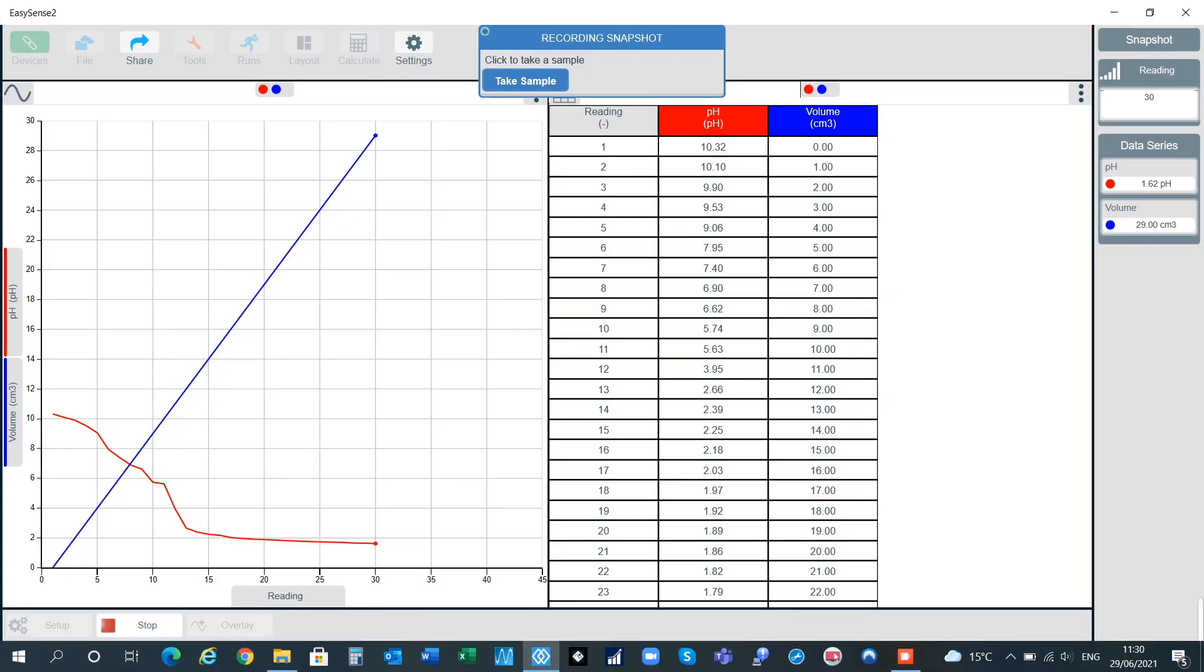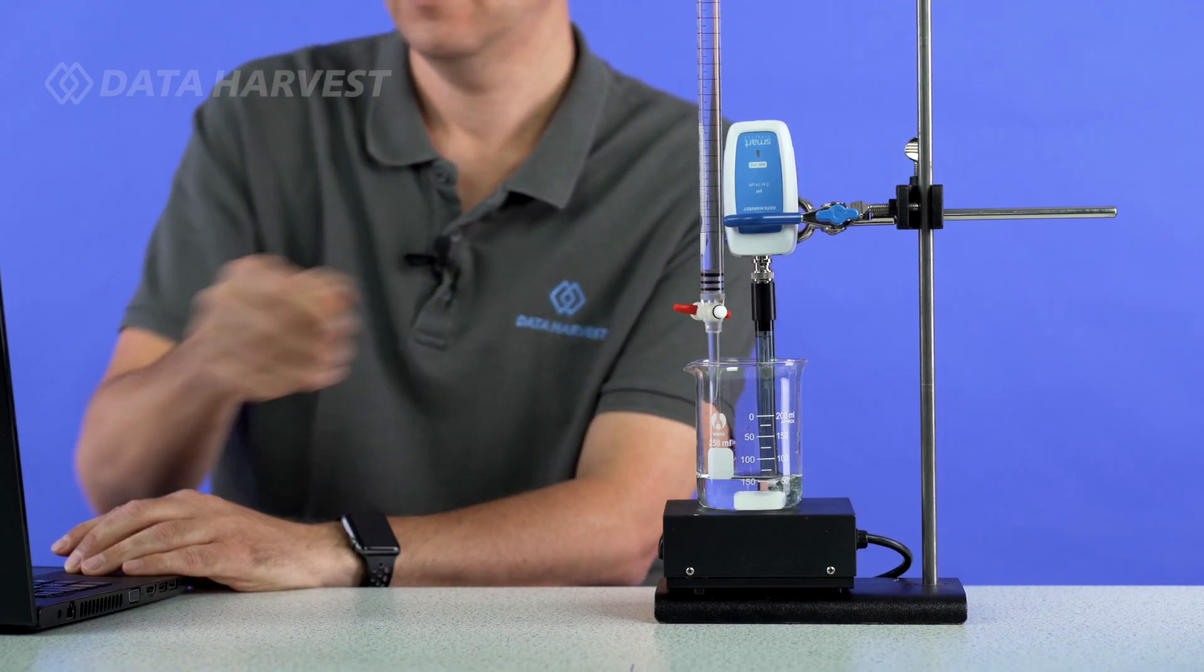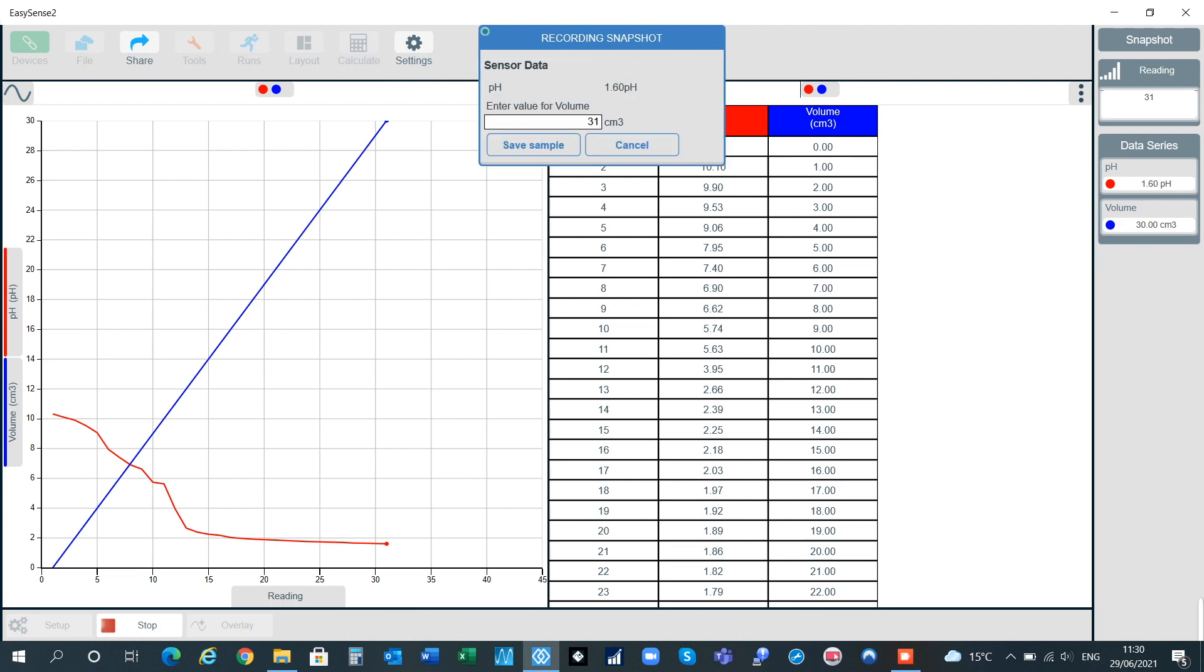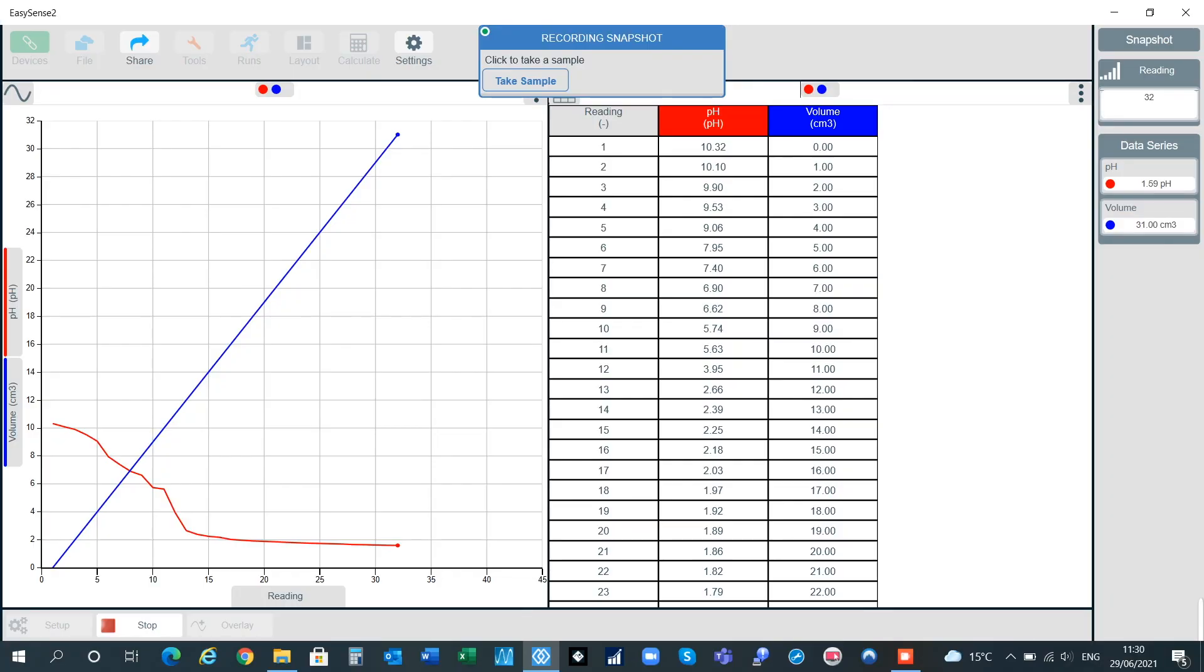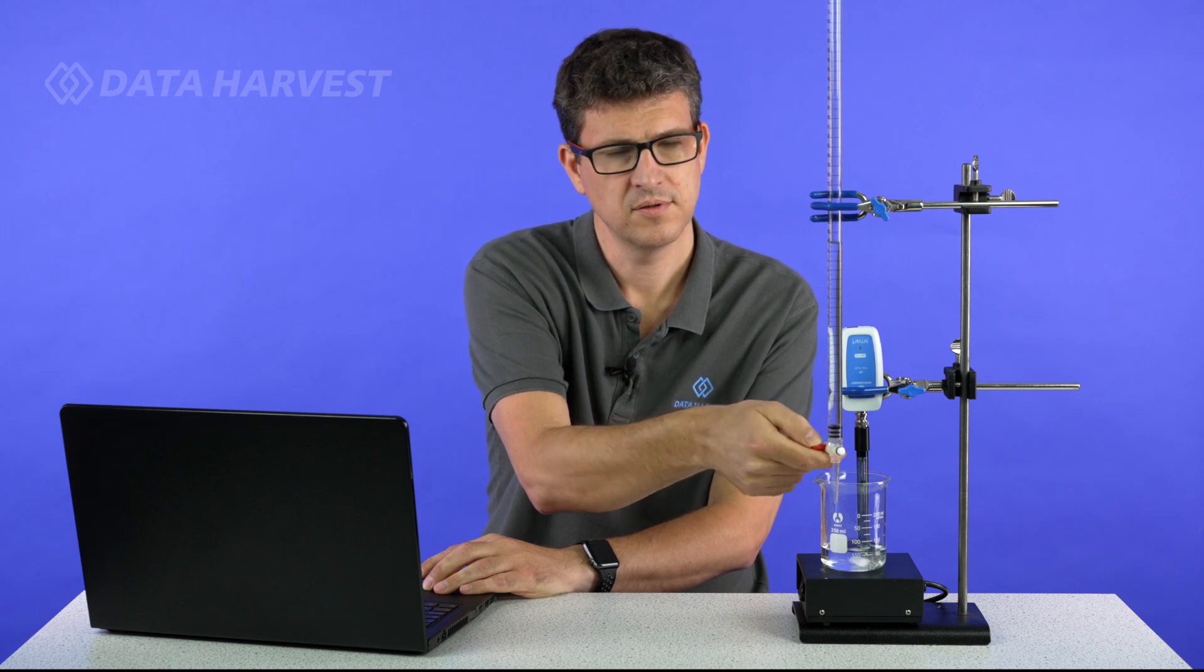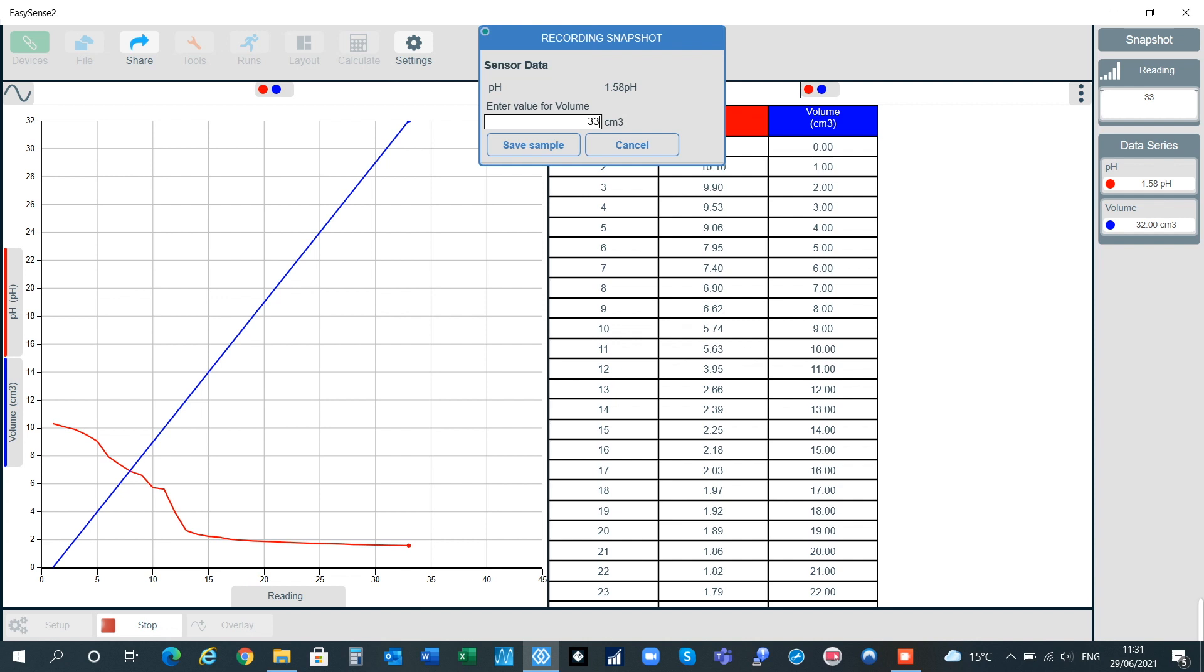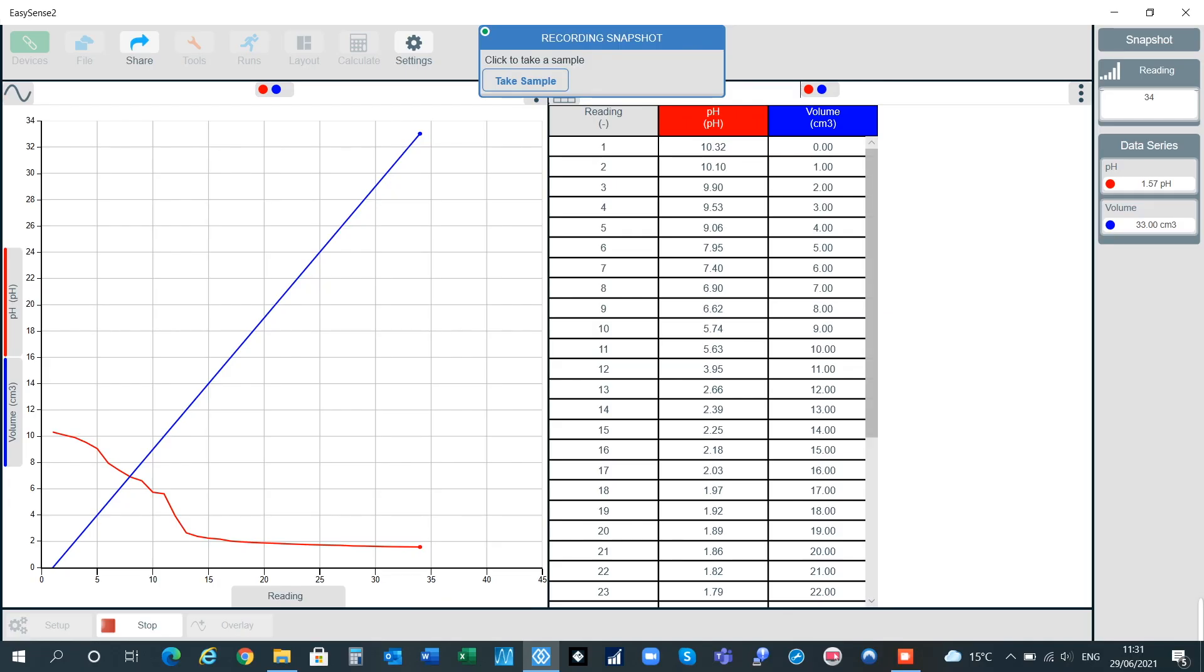I'll carry on going. You can see already now that I'm pretty much there, but I'll carry it through just so you can see exactly how much. And we're now down to 30. Or up to 30, whichever way you look at it. We're now on to 31. You can see the graph there. It's not too bad at all. Down to 33. 34. 35.